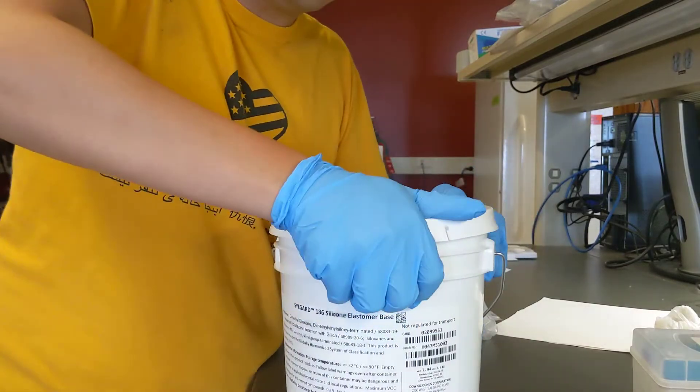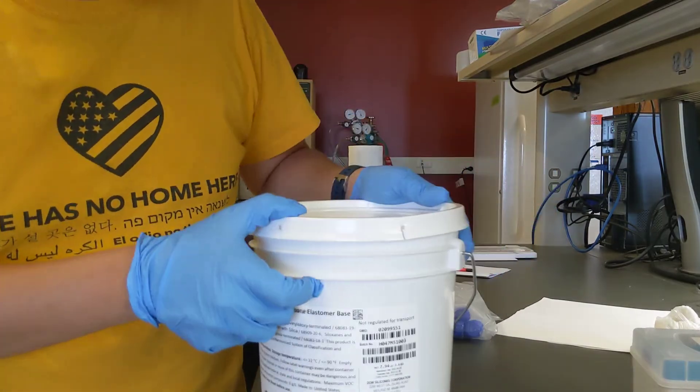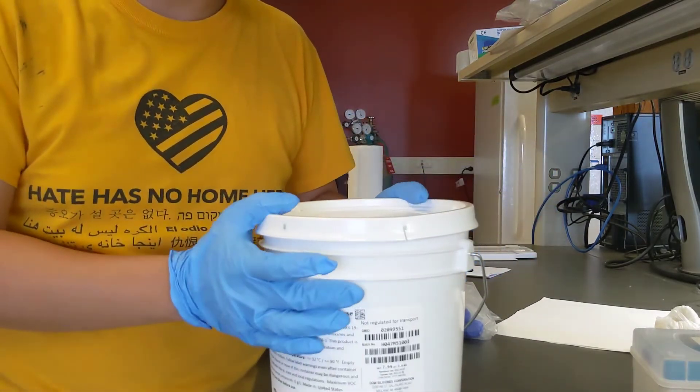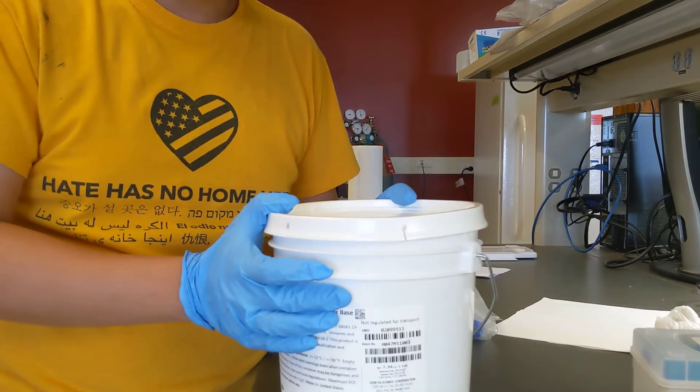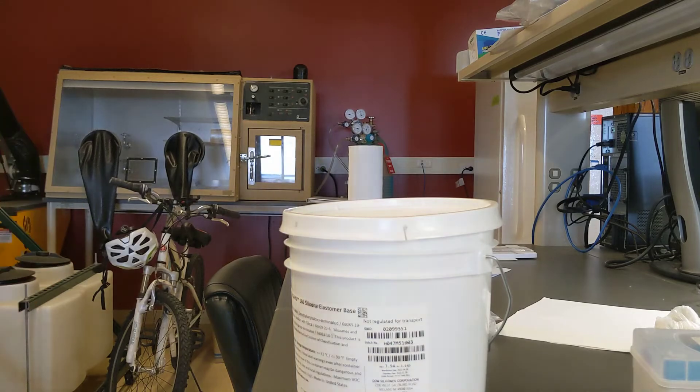This is the way you open the big jar of PDMS, whether you purchase it from Dow or somewhere else. Hope this information helps and I hope you enjoy having fun with your PDMS. Thank you.